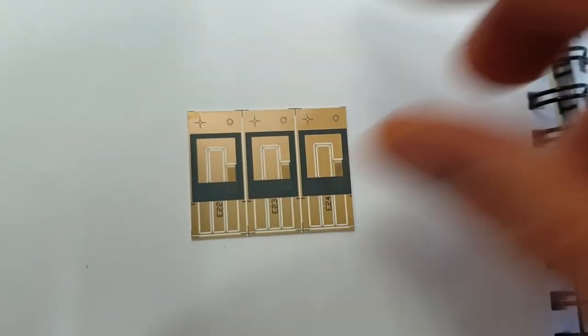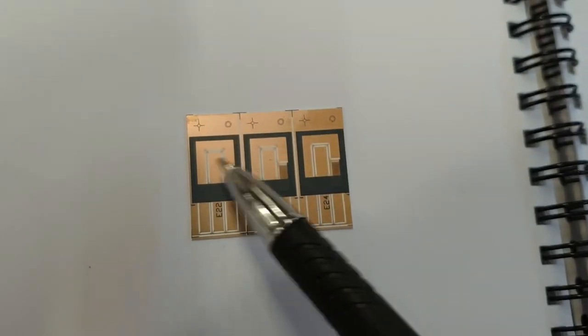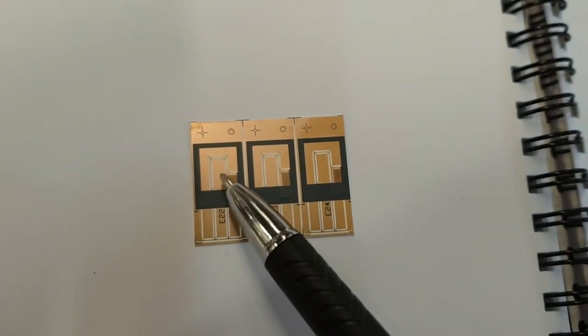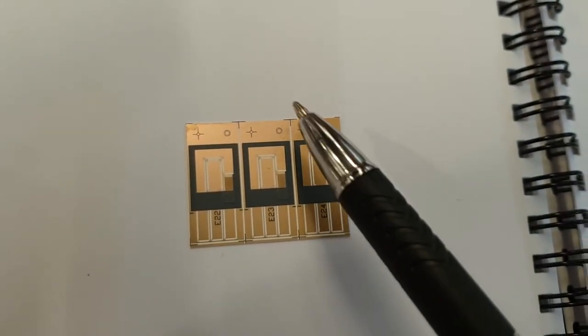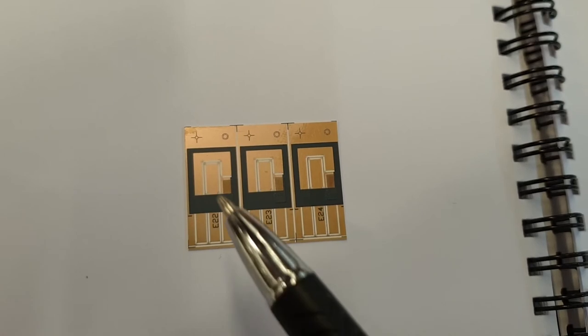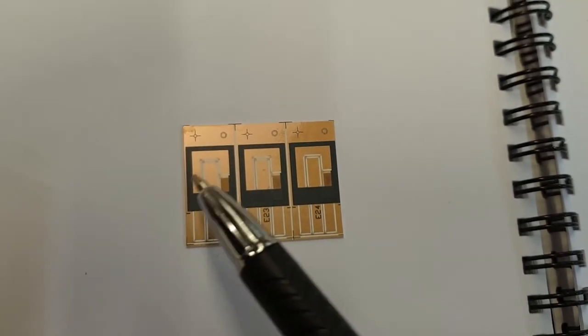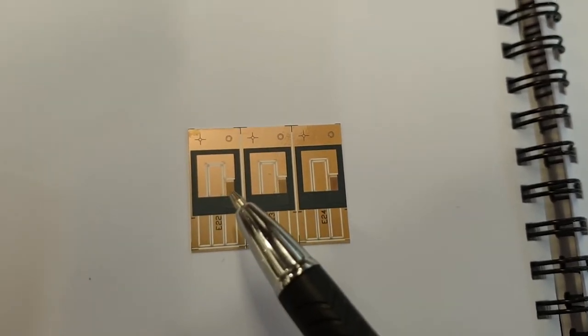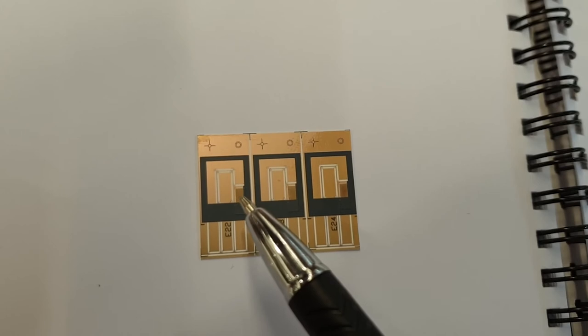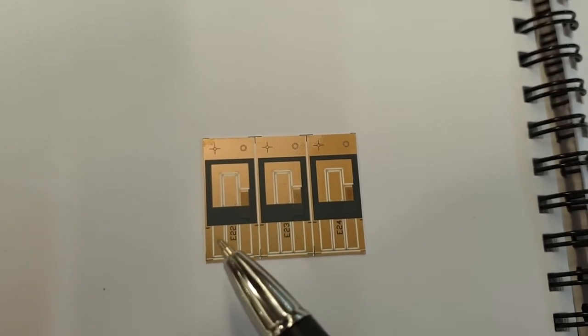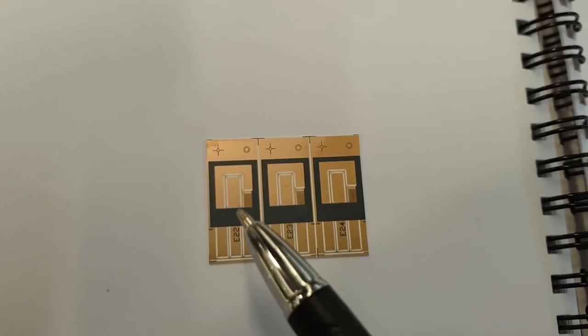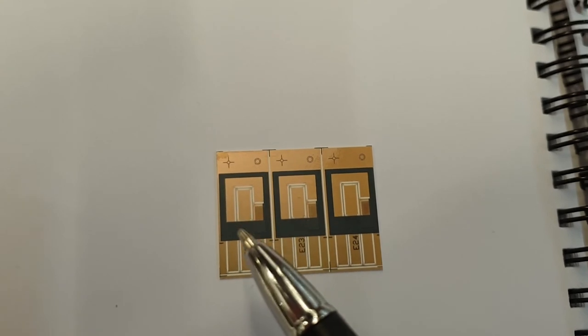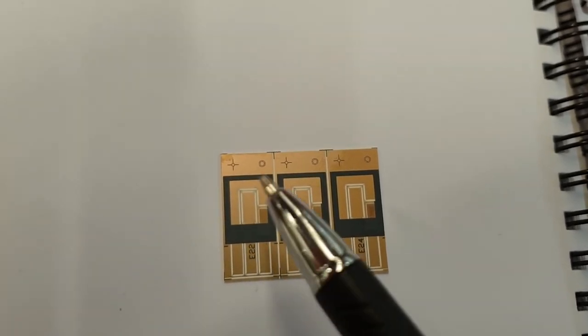What we have here are three electrode systems together that are singulated, so you've got a working electrode, a counter electrode, and a reference electrode. The slightly darker patch is the silver chloride, and you can see here the gold patch. This one happens to have a hydrophobic circumference which helps to contain the droplet.